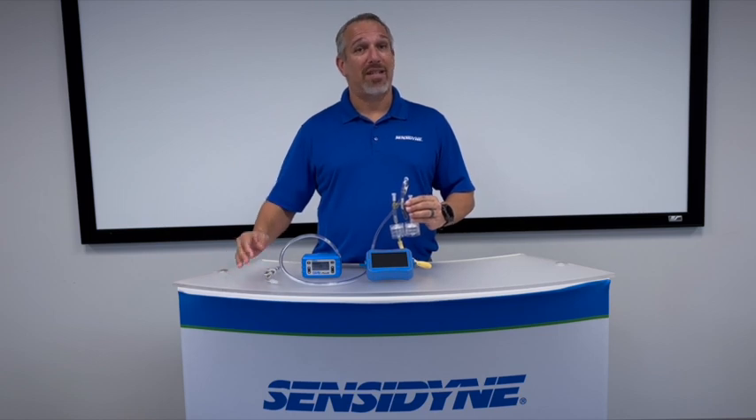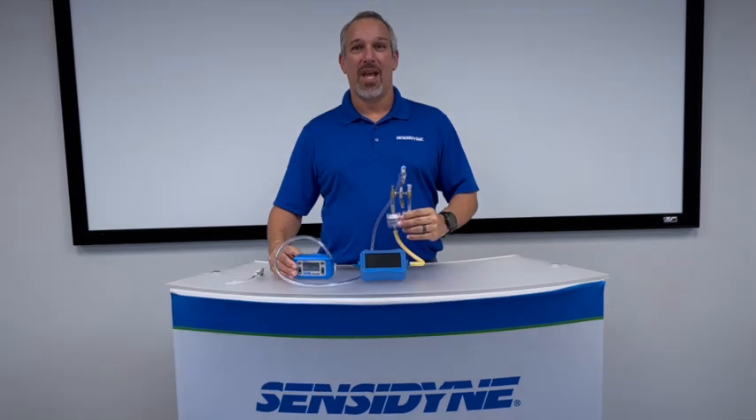Another scenario would include simultaneously sampling both a particulate sample as well as a sorbent tube. Sensodyne is unique in our ability to perform this type of sampling using our Gil-Air Plus pump in high-flow constant pressure mode.